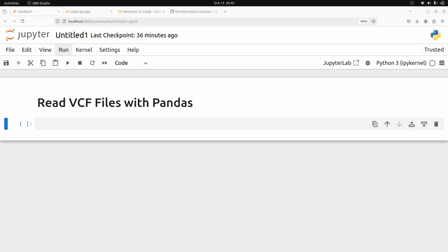In this video, I'm going to show you how to read VCF files using the Python package Pandas. So let's get started. First of all, we need to make sure we have Python installed on our respective computers, and we should also have the Python package Pandas installed.